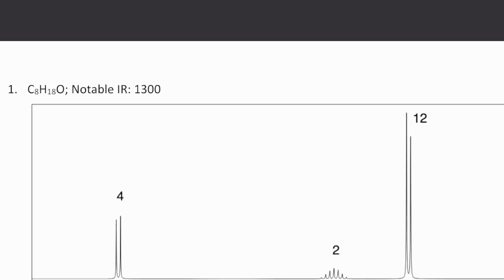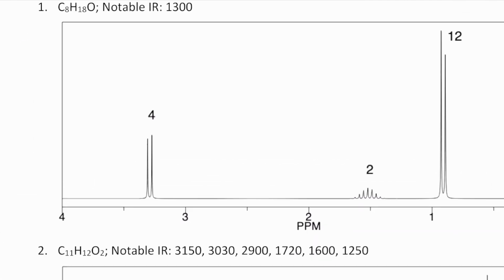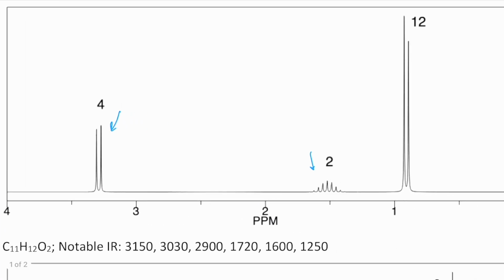Okay, so first thing we got to talk about is what the heck are all these weird lines on this graph. So this is a proton NMR graph, and it's showing the different hydrogens we have in a molecule. And you'll see this one has 2 peaks, this one has a bunch of peaks, and then here's another 2 peak. Okay, so a single peak represented by a straight line, when we're just kind of freehanding it, is called a singlet.